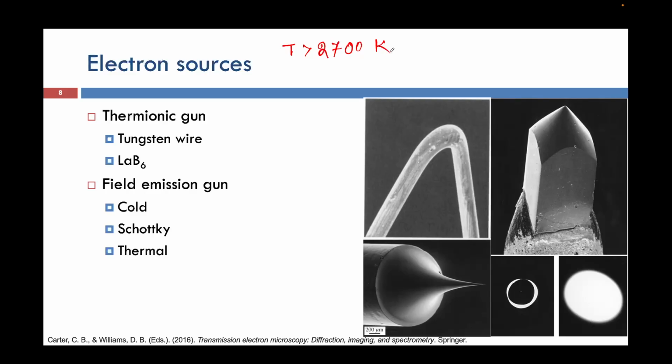This tungsten wire or material emits light as well as electrons, and our focus is to only collect these electrons, right? So when we provide a huge accelerating voltage to the electrons coming out, they will go at a very high speed towards our sample.